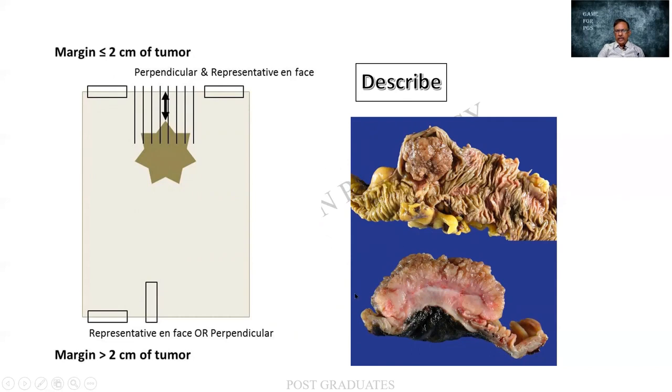And when I cut it and give the bit, it is going to be this kind of one. It is not possible for me to include everything in one slide. Therefore, it can be bisected. Always have part of the specimen preserved with the original specimen so that you can always reconstruct and look back after you see the slide. This is called post-biopsy wisdom.